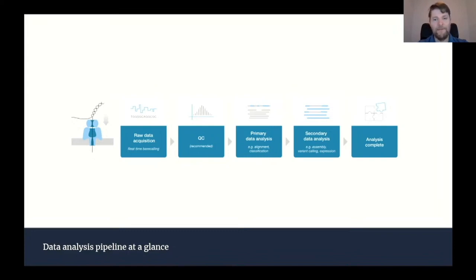And this can be multiple different things. It could be basically trying to find specific sequences that are related to cancer. That's one application.